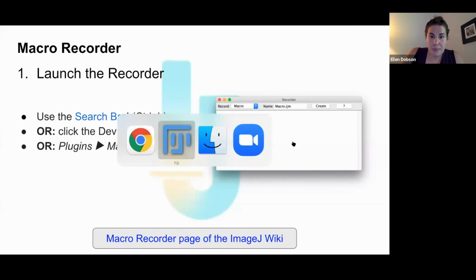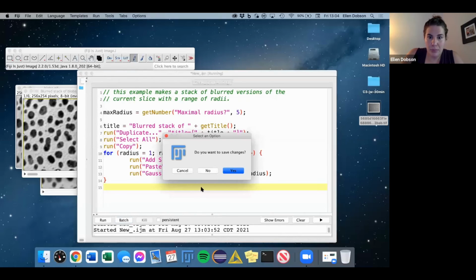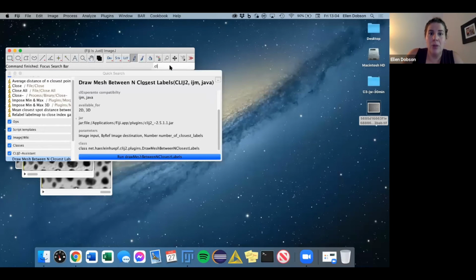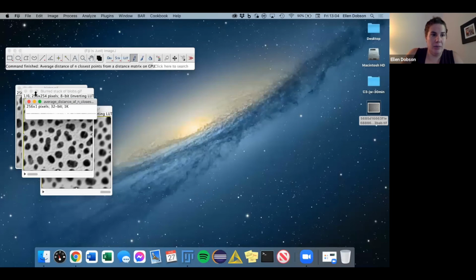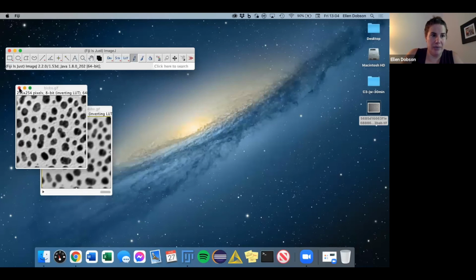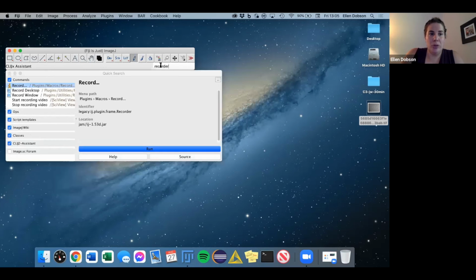So let's go back and let's just close everything. We're not saving the changes for now. We're just going to close all. Let's open something else. I'm just going to close all the images. Don't save, don't save, don't save. Okay, so we want to open the recorder.